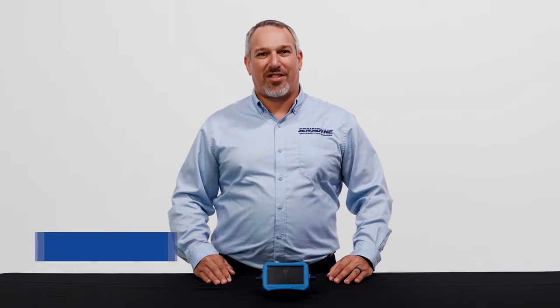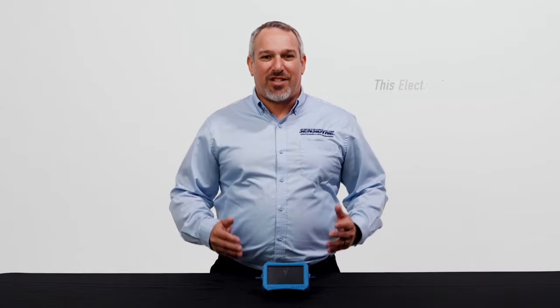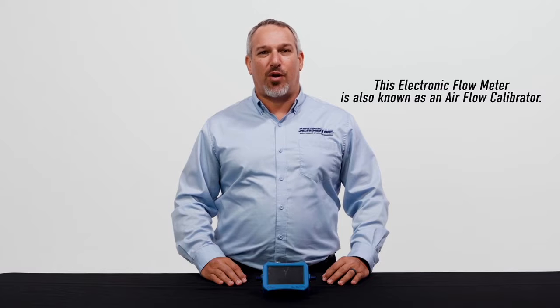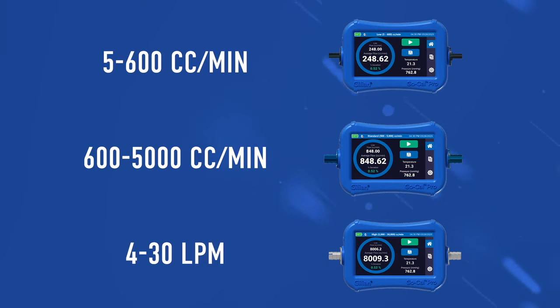Hi, I'm Aaron Apostolico, Sensonine's Product Applications and Research Manager. I'm really excited to talk to you today about our newest addition to our Gillian line of health and safety instruments, the GoCal Pro. This is the next generation of electronic flow meters used for air sampling. This flow meter will come in three different models.